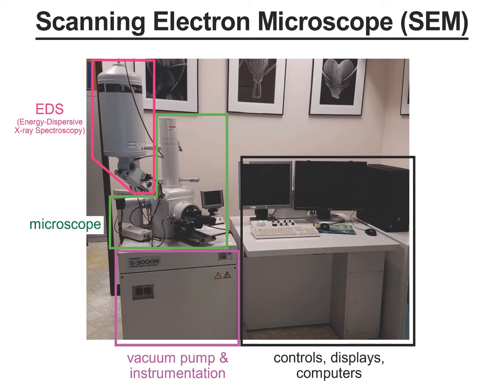In our museum research, EDS is important for some of our studies of organisms, for characterizing some minerals, and in some cases for examining archaeological artifacts. Near the end of this presentation, I'll mention EDS again in relation to my own research.